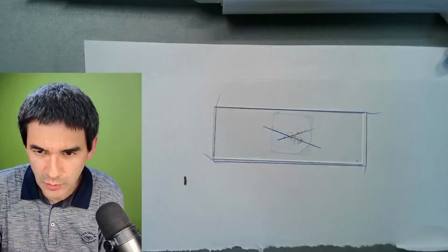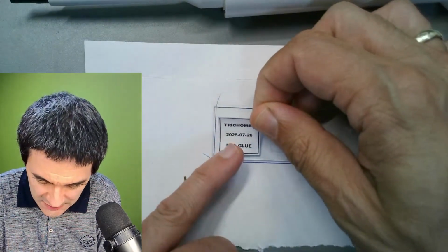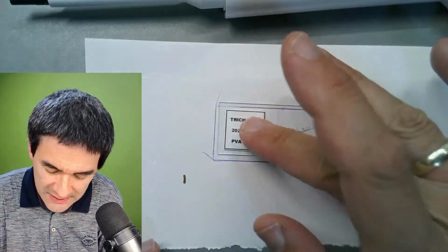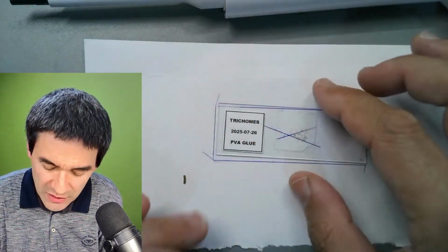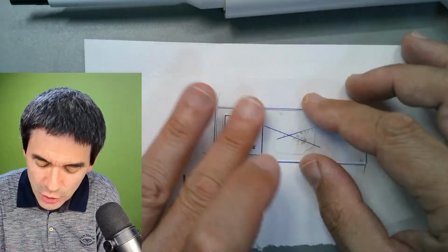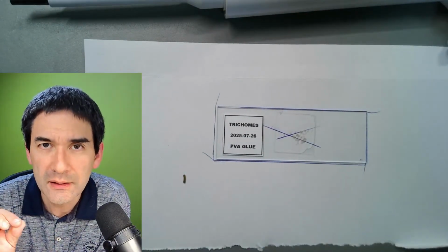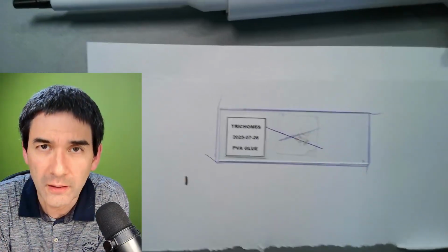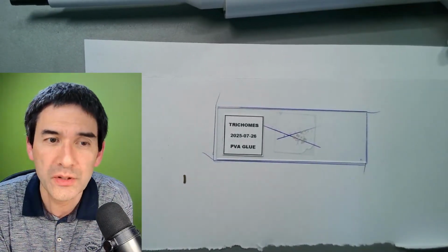So there's a question already, what do the trichomes do? Yes, the trichomes can help with water retention, but they can also serve as protection against insects. Those trichomes reduce the so-called transpiration, because on the bottom of the leaf there are the holes called the stoma, and over the stoma, of course, oxygen is given off and carbon dioxide is taken into the leaf, but also water vapor is lost.